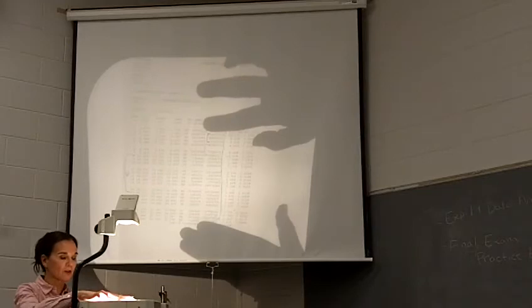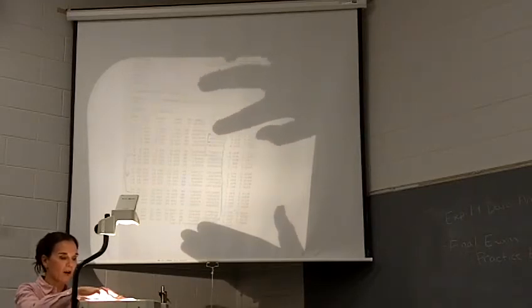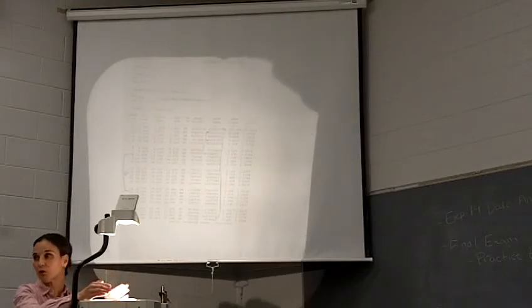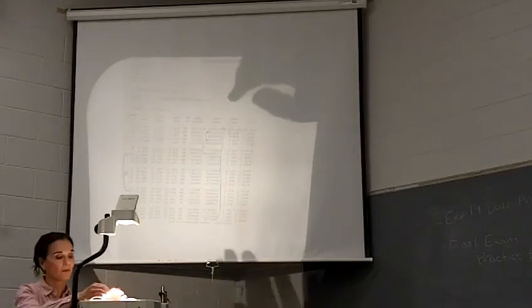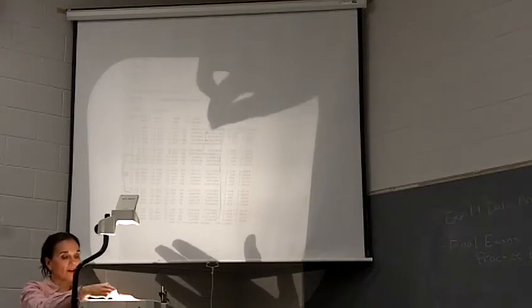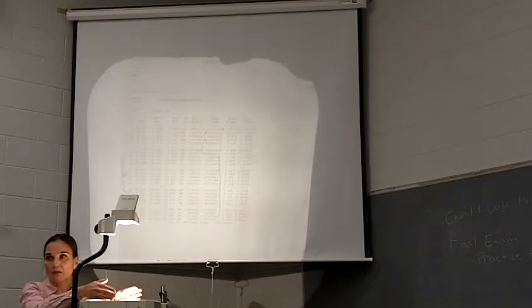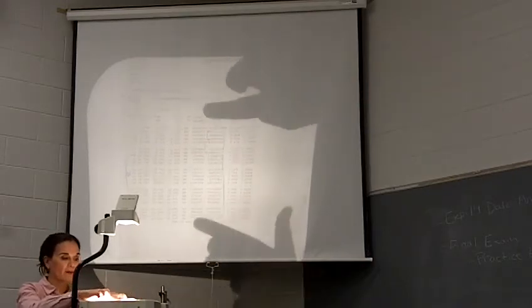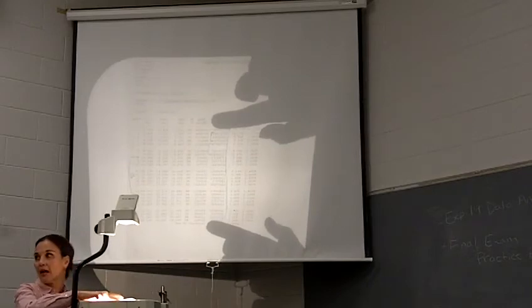So what you need to do then is take all these peak areas and add them up. That is your new total peak area. Then you're going to take each piece that you're going to look at and divide its peak area by that new total peak area. So just toluene is going to have this peak area divided by this whole peak area added together.